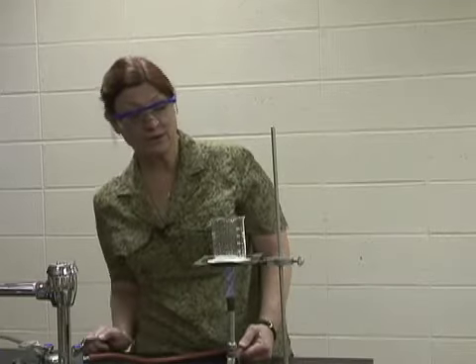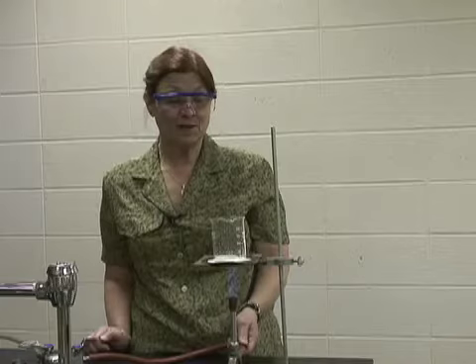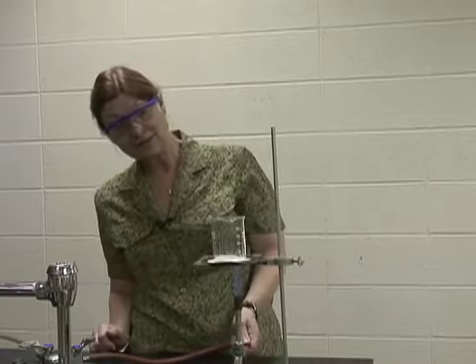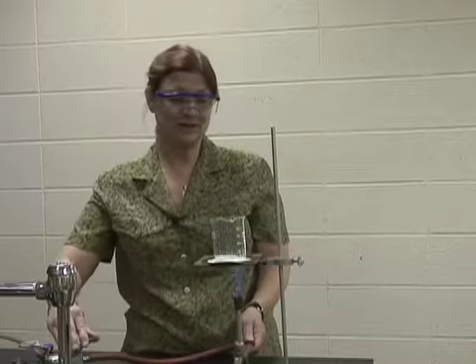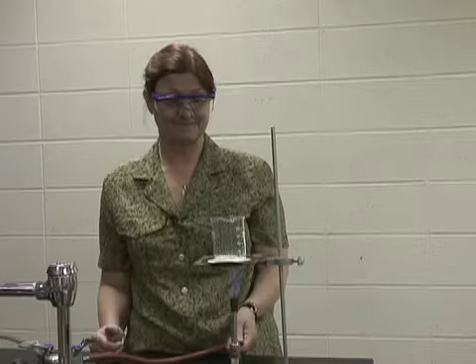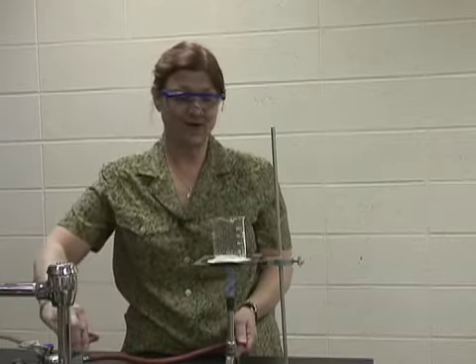Now remember, we're getting an experimental value, so sometimes our ratio doesn't come out to be what the theoretical is of magnesium chloride, with magnesium being +2. Sometimes it could be a little different. But that's just experimental variables, and that's why we do experiments. I think that that's dry.